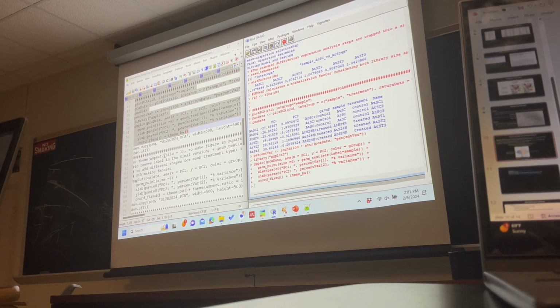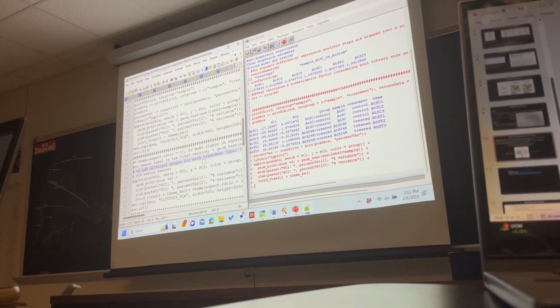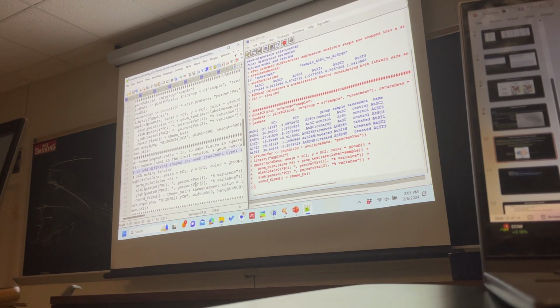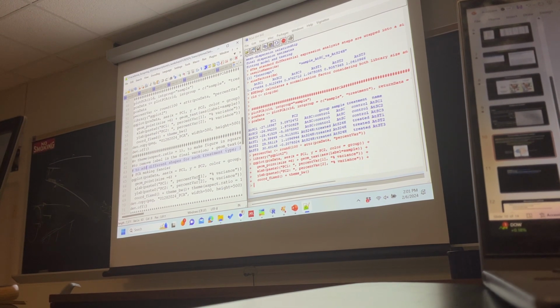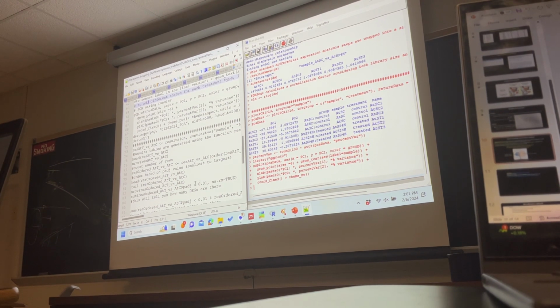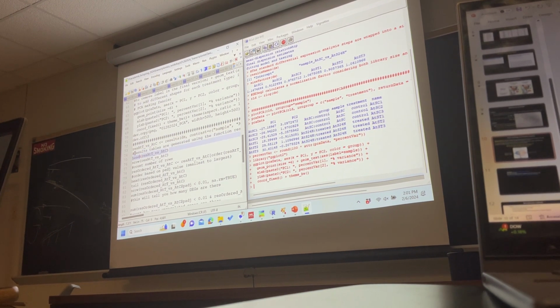If you just Google PCA, DESeq2, you'll see a lot of resources there, and even the general MA plot that we will be generating soon, you can make it so fancy. It looks really good when you first see it. Just have that type of mentality, I don't know. Go from here.